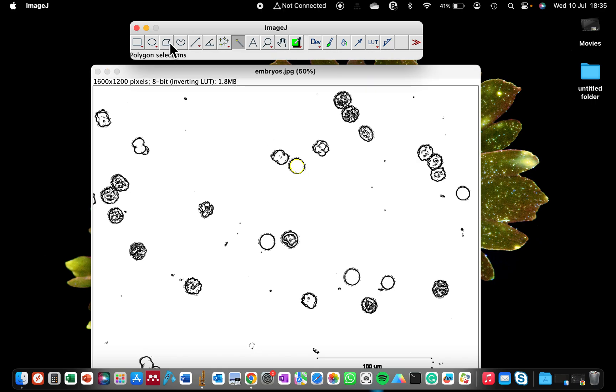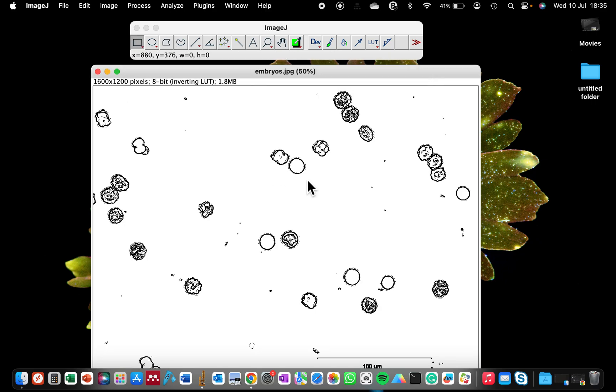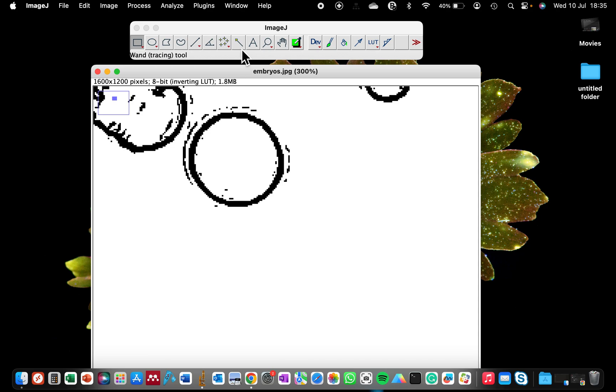Let me zoom in very well so that you can see. This perfectly round cell, I'm interested in it. And if I choose my magic wand tool and I select it, you can see the yellow ring that is highlighting the inside of that cell.